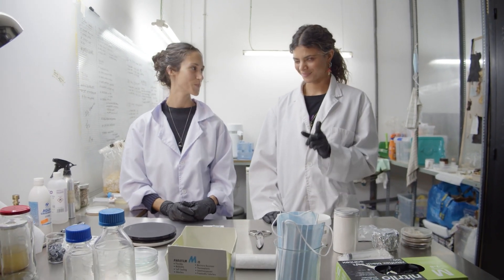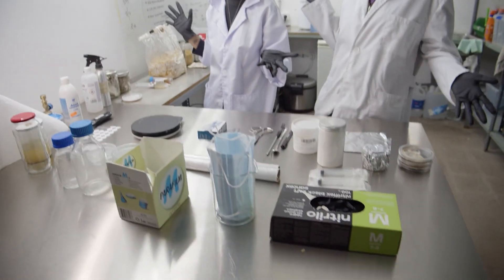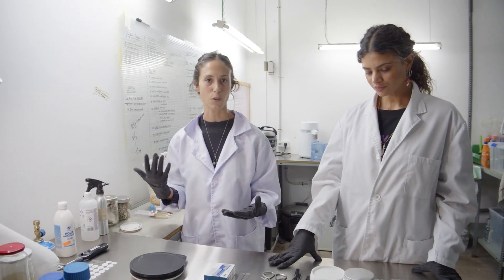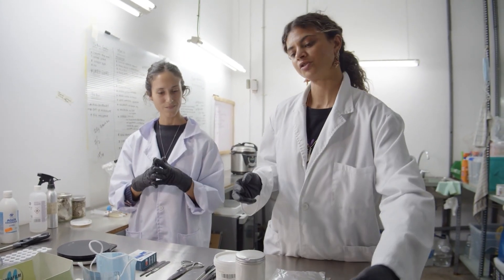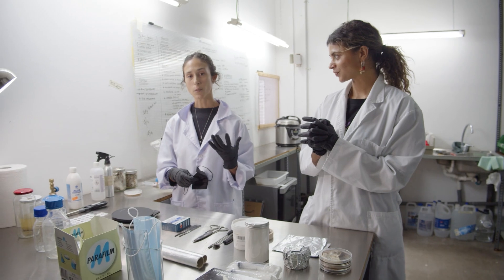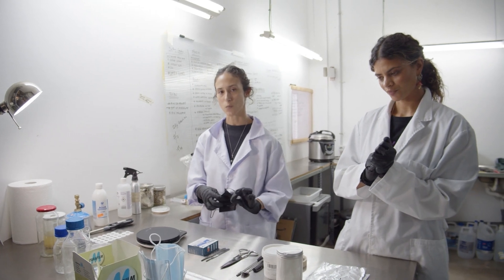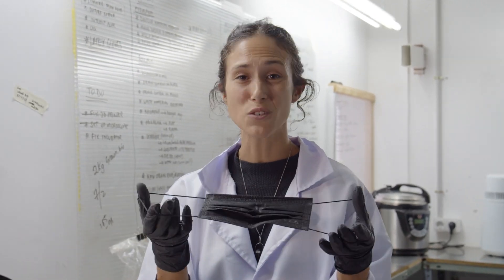Some of the other things we have in our lab — we'll walk you through what you'll most commonly see in a lab space when working with mushroom mycelium. Having gloves protects your skin from falling onto your work surface. These can be latex or nitrile. You can also use rubber gloves, though they give you less dexterity, which can be tricky for delicate processes like agar-to-agar transfers.